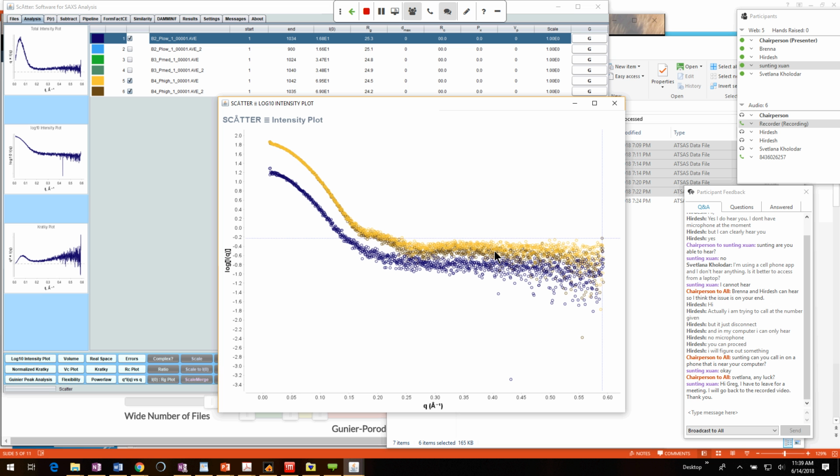In that preliminary assessment that you sent with radius of gyration already estimated, when I try to estimate it with HT-SAXS, by default it takes fewer points than suggested in your app in the Guinier region, so it's a different radius of gyration. And it's hard to tell when to stop because the residuals still look pretty good even if you go further, like 57 or 67. How do you make the decision where to stop?